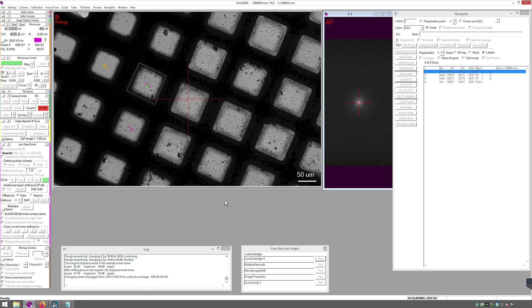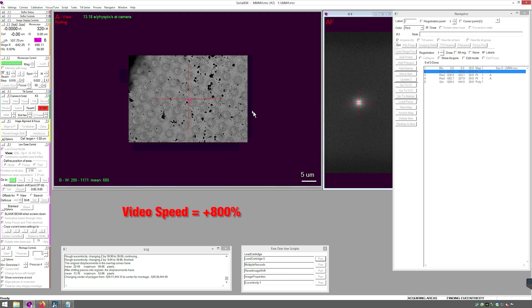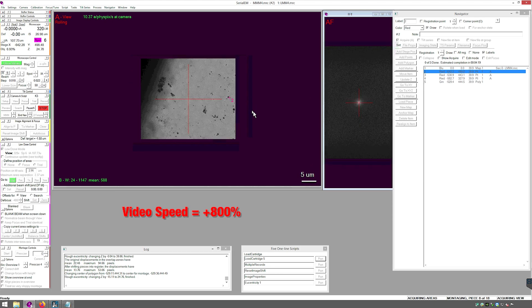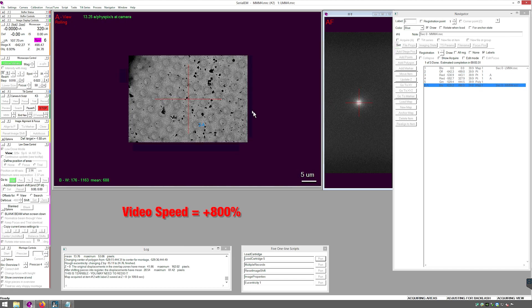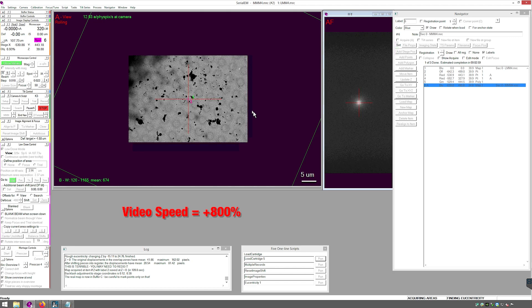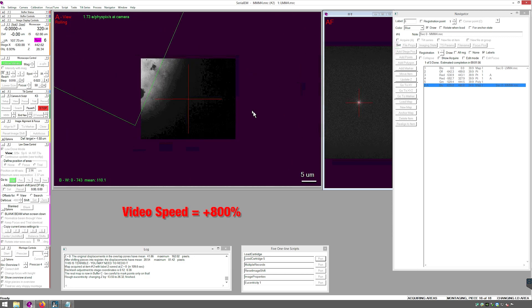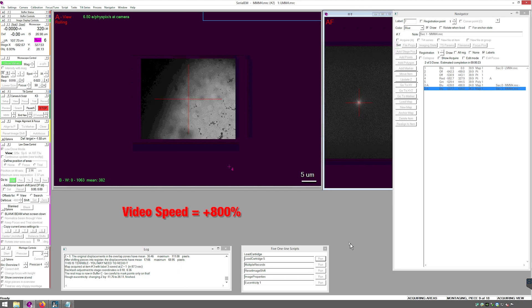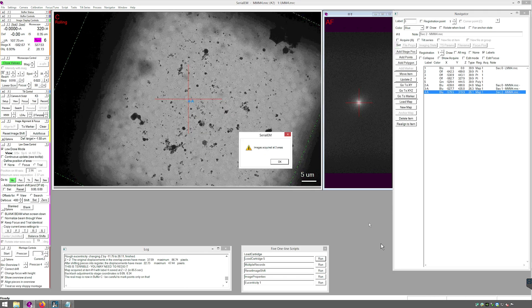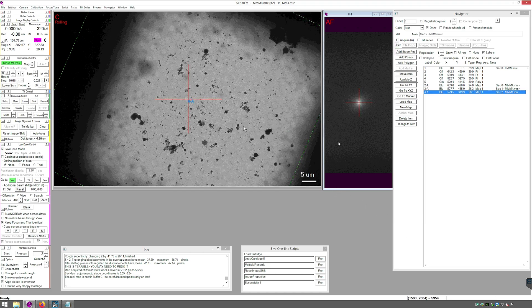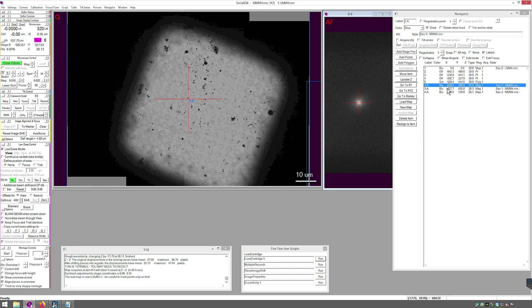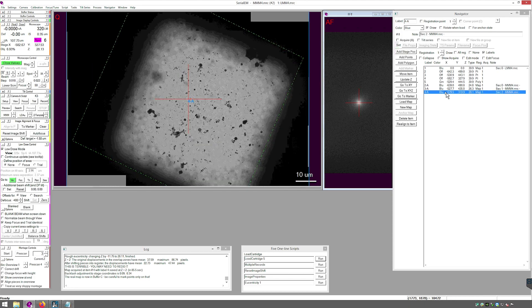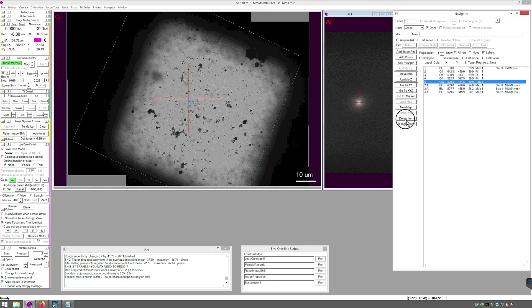The software will move to each point with an Acquire Tag, run Rough Eucentric, and then collect a map and save it as an item to the Navigator. Press OK when Serial EM has finished collecting the Medium Mag montages. Review them by double-clicking each one in the navigator.